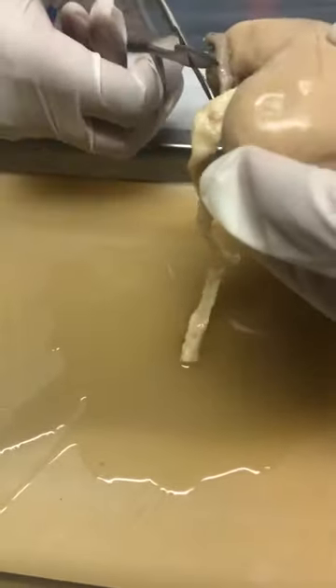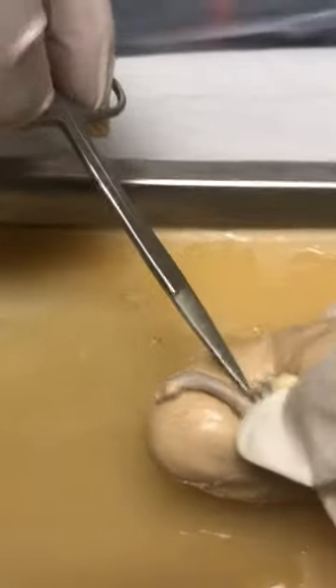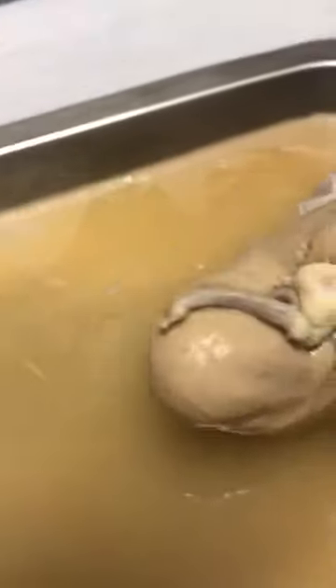I'm cutting the ureter off so it won't be in the way. This part is the ureter. This is the artery. These are the veins and the hilum is right in here.